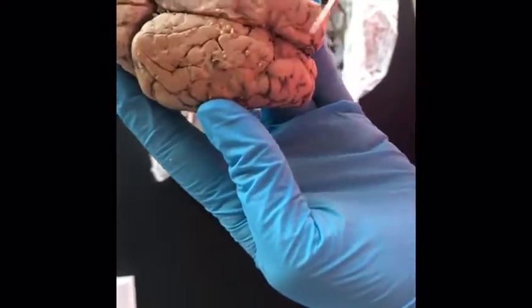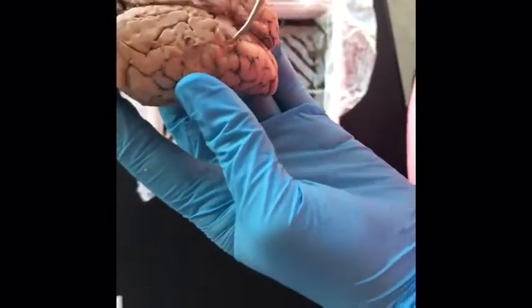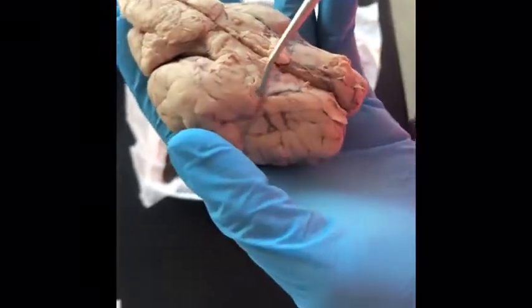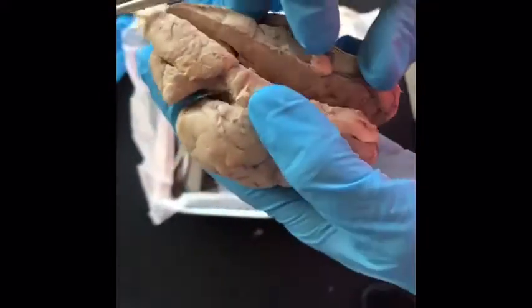Gyri are bumps that can be seen on the surface of the brain. The sulci are the grooves that fold or ridges that make up the folded surface of the cerebral cortex. The longitudinal fissure is a deep groove that separates the two hemispheres of the vertebrate brain.